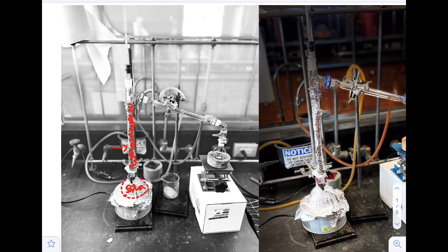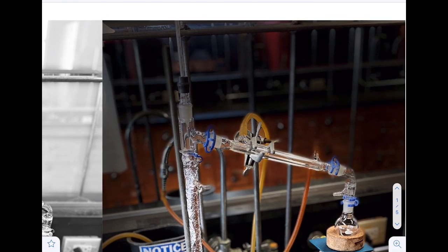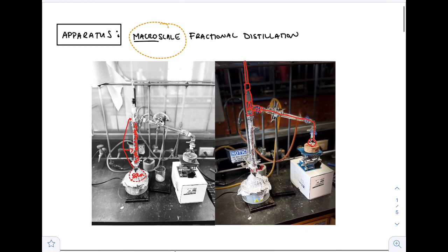Okay. So now as I heat this, it's going to go up and then it's going to condense in here, which you can't really see that well, maybe you can see it on this one. But we have a little thermometer here. You can see the tip of it, and then up on the top, of course, with our little outlet adapter, it's attached here, on the top of the distillation adapter. So that thermometer is useful because while you're doing a distillation, you want to get the temperature of the vapor, okay? And the vapor is going to essentially just kind of touch that. It's going to condense and then go down here as a liquid. And then it's going to drip down into this collection flask.